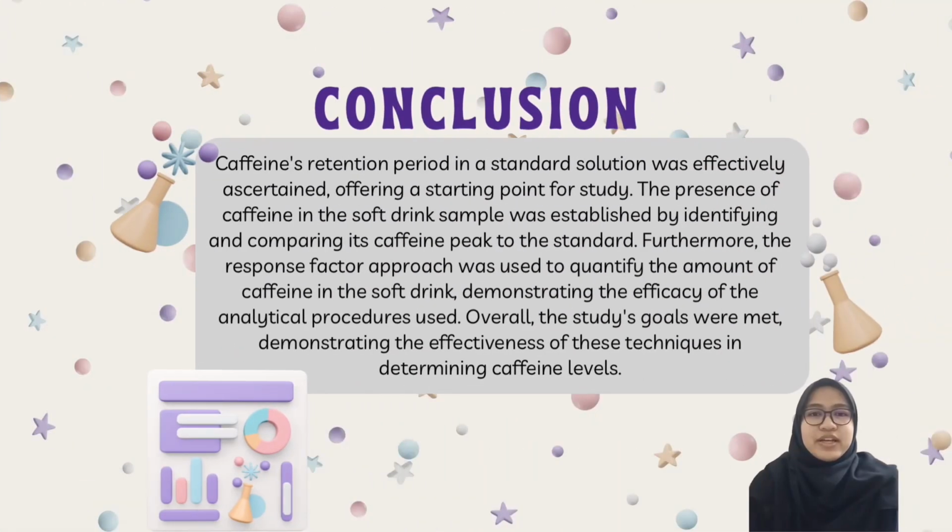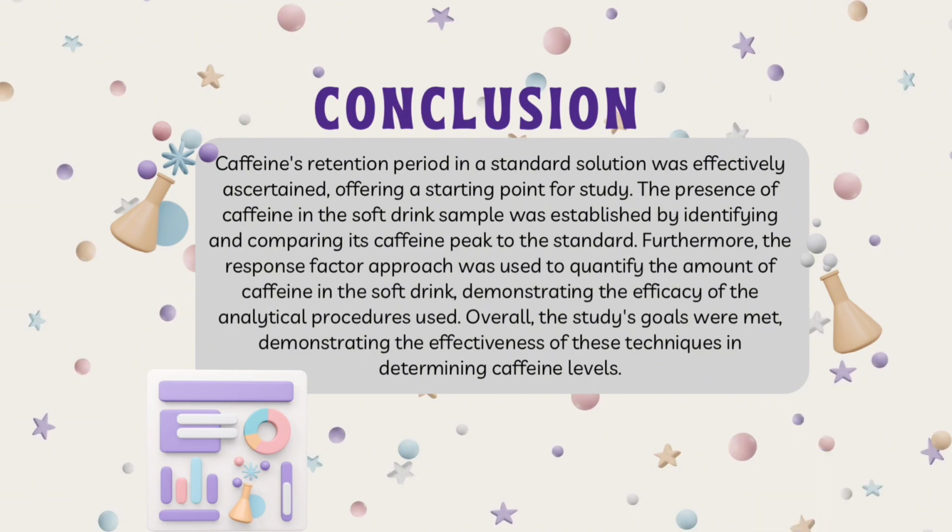Caffeine's retention period in a standard solution was effectively ascertained, offering a starting point for study. The presence of caffeine in the soft drink samples was established by identifying and comparing its caffeine peak to the standard. Furthermore, the response factor approach was used to quantify the amount of caffeine in the soft drink, demonstrating the efficacy of the analytical procedure used. Overall, the study's goals were met, demonstrating the effectiveness of test techniques in determining caffeine's level.